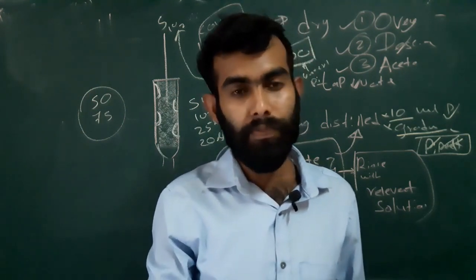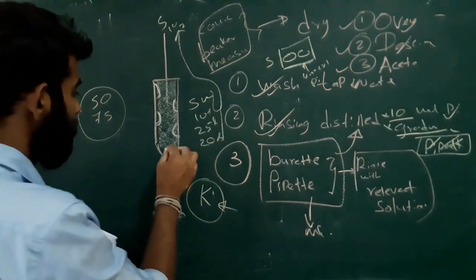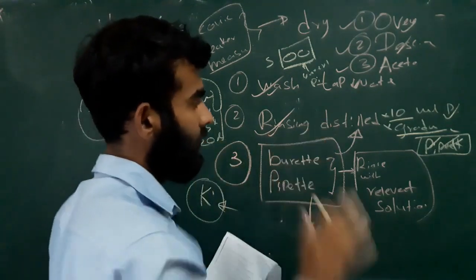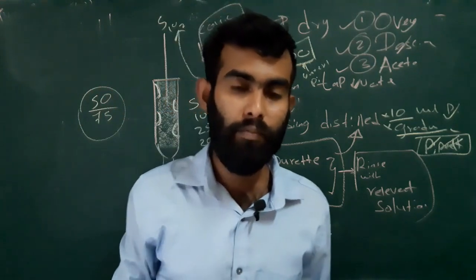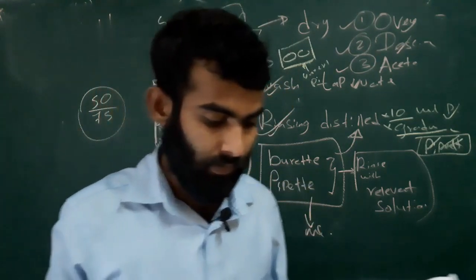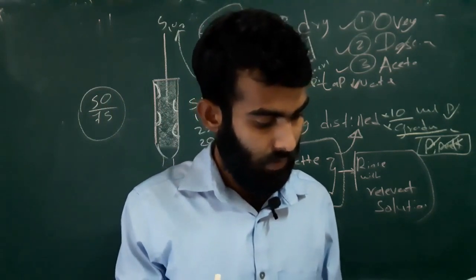So we have to swirl the reaction mixture, and every time these solutions we have to swirl very well, because we need a homogeneous solution. Okay.